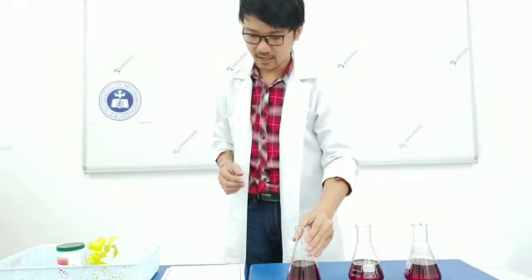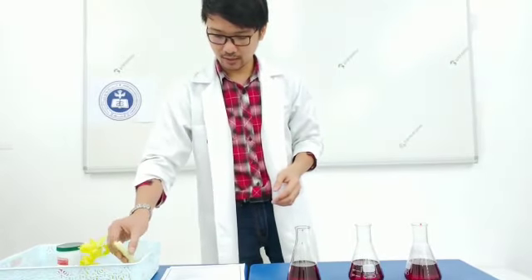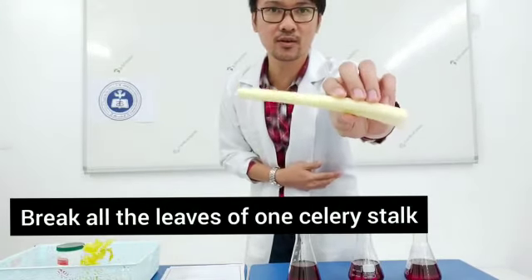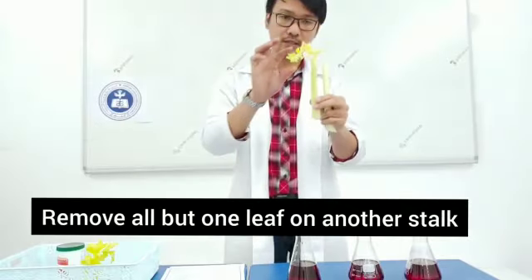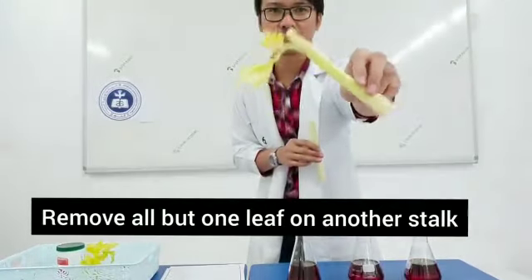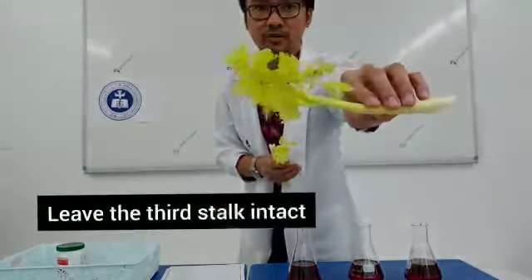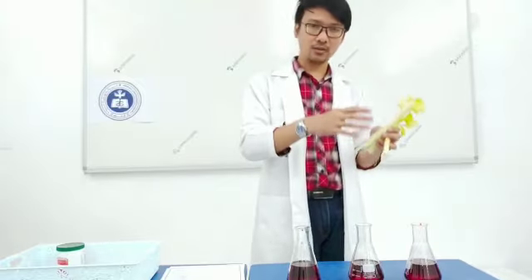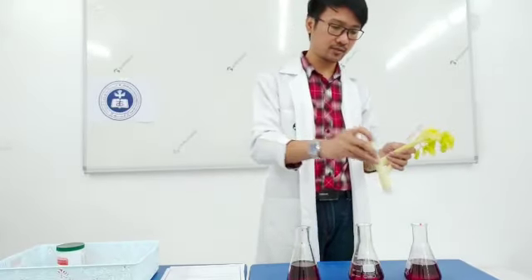After that, for our first flask, we are going to put a stalk wherein all the leaves were removed, so it is just the stem. On the second one, we're going to put a stalk wherein there is only one leaf left behind. On the last one, we're not going to change anything; the leaves will all be there. Now we're going to put all of these into the conical flasks. Let's start with the first one.